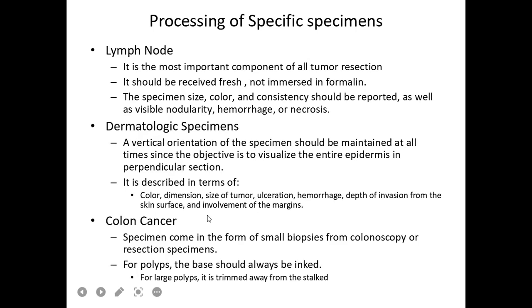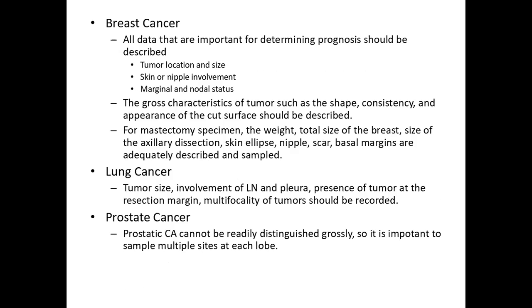For colon cancer, specimens come in the form of small biopsies from colonoscopy or resection specimens. For polyps, the base should always be inked because that is very important, no? Sa tinatawag natin invasiveness. For large polyps, it is trimmed away from the stalk. So the processing of specimen, no, varies with the type of specimen that you have.